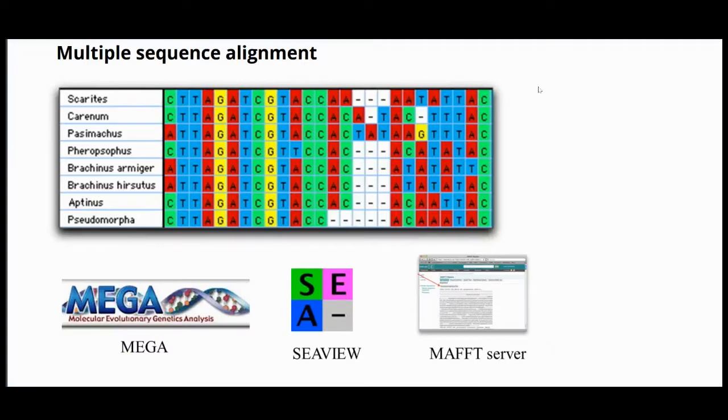So this is a multiple sequence alignment. I mean, basically a picture of it. Here each column is a character, and these different nucleotides are character states. Here C and A are character states. So these differences are an indication of phylogenetic signal. These are the phylogenetic signals.